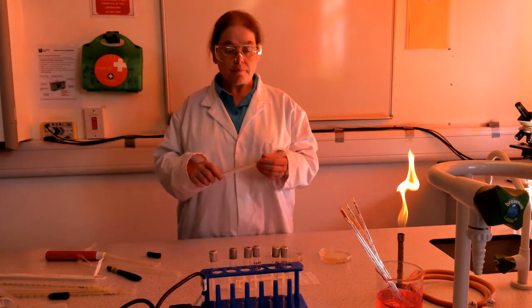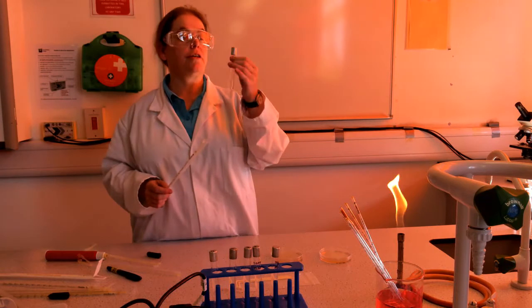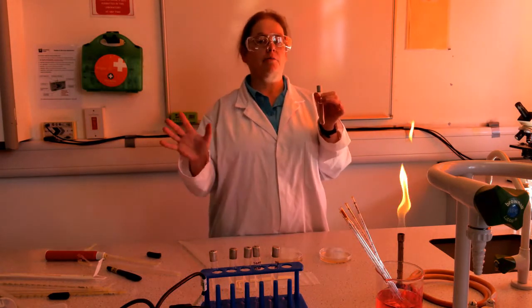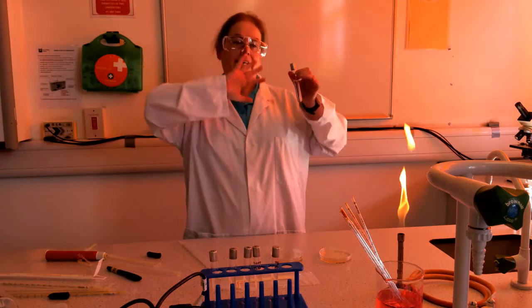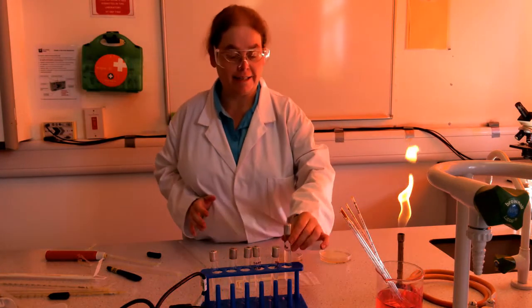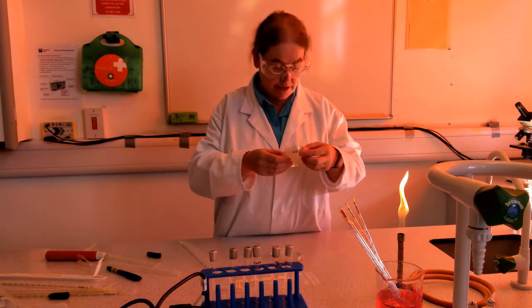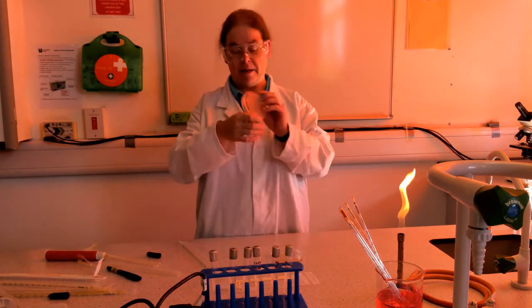I won't bother doing the 100 dilution because usually there are so many bacteria on that, if you spread them on a plate you just get complete goo everywhere, solid bacteria. So I'm only going to plate out the 10,000 and the 1,000,000.